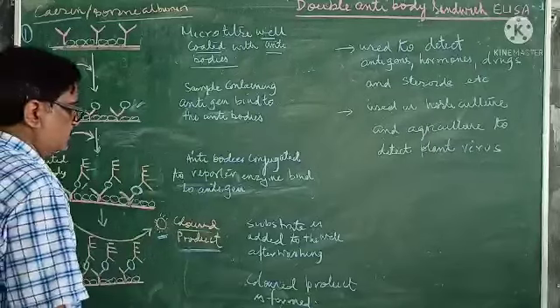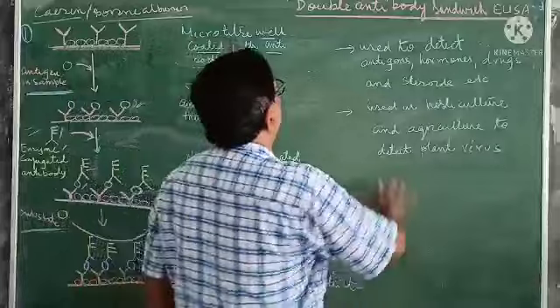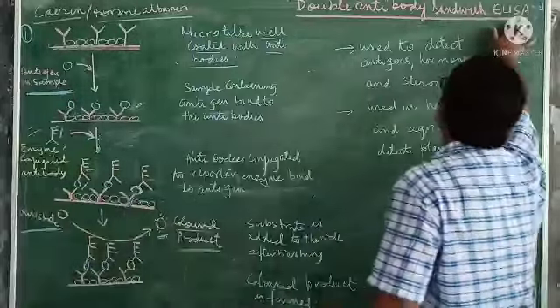Okay, so this is the process of double antibody sandwich ELISA.